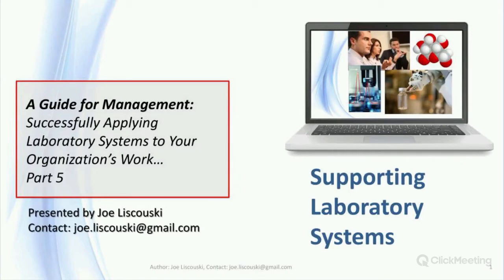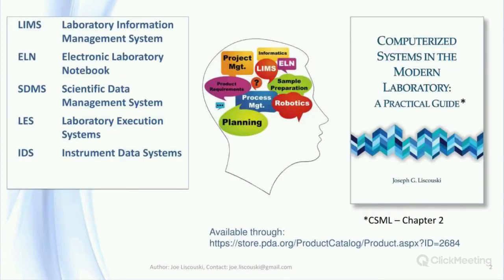We'll be looking at the support requirements for laboratory informatics. That includes the roles of lab personnel, IT support, and vendor relationships. As we've noted in these webinars, this companion book will provide useful background information on the technologies, support, and other factors that can impact your ability to effectively use these systems. It should prove to be a useful reference as the webinars get into more technical details. Much of the material in this session is expanded on in Chapter 2 of the book.